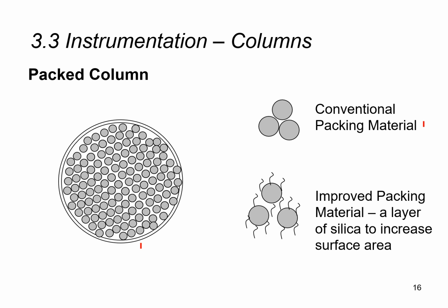and then as technology improved, scientists were able to coat these silica beads with this hair-like silica structure. You see this hair-like silica structure here, and this increases the surface area with which the various chemical components can interact. With greater surface area, this will allow better separation to occur.